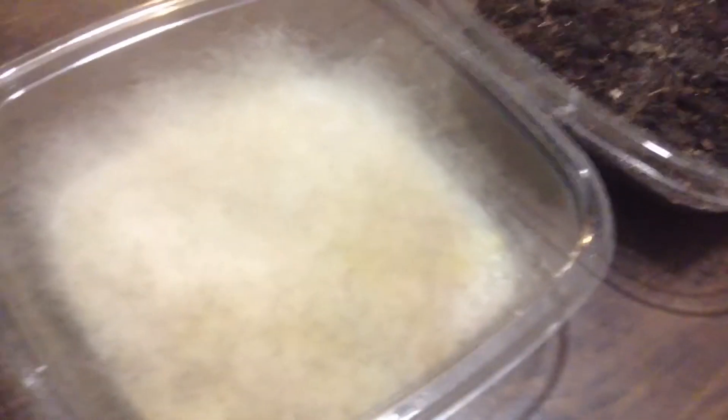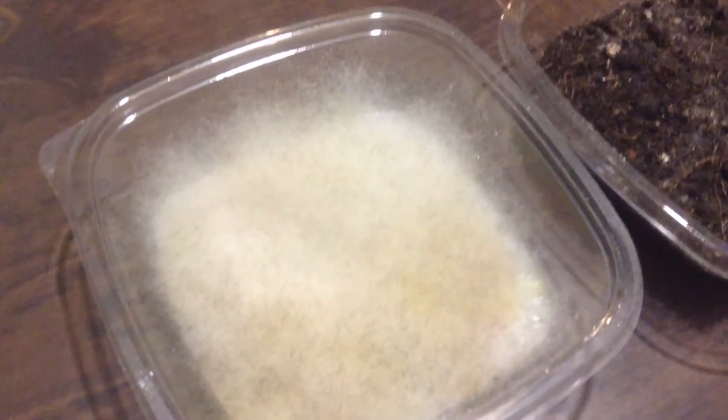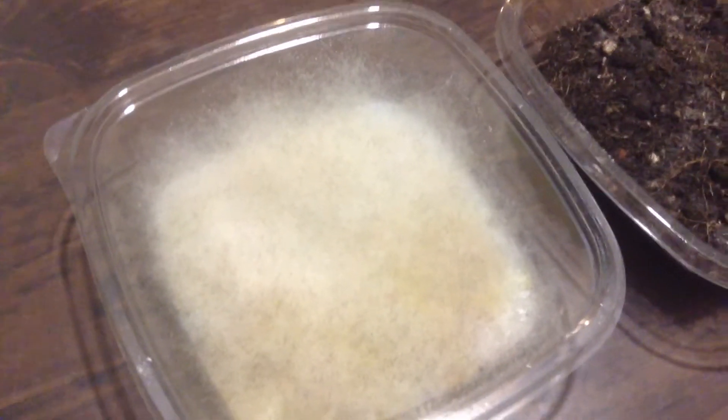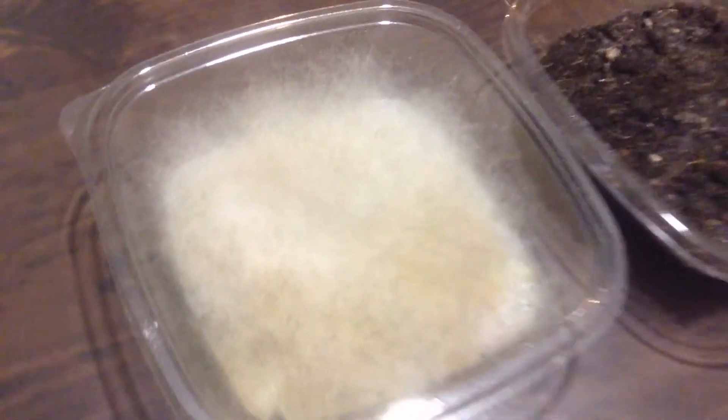As you can see, amazing results. The reason there is so much growth is there are a lot of carbs there for the mycorrhizal to grow in numbers and in size. I mean, look at the hyphae — it's just going crazy there.